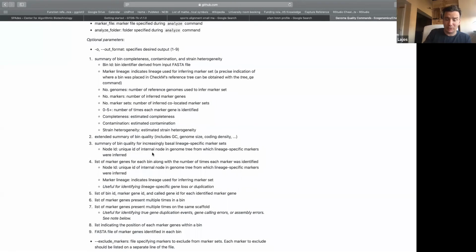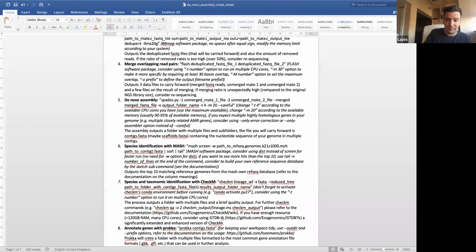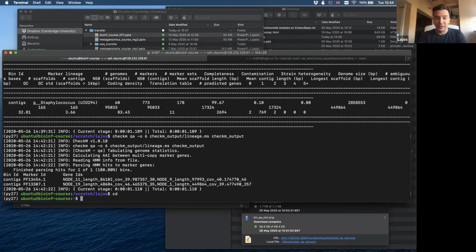I think I will go to the next stage now, because I want to discuss at least 2 more programs, and then we can also have some kind of wrap up at the very end of the de novo assembly pipeline. So the next thing, which you probably want to do for multiple purposes, is to annotate the genes. So I again ask only Joe to do this with me. So let's go back to our home directory and install PROKKA.